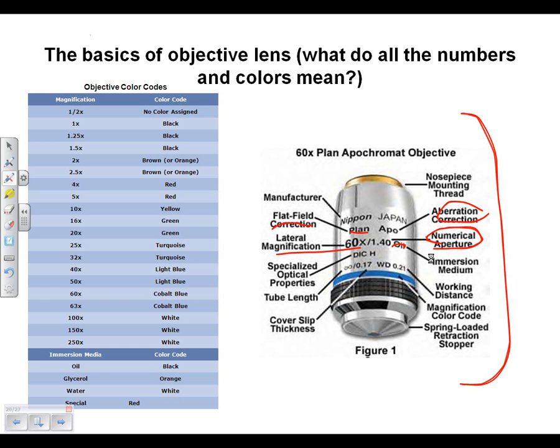And that's because to get really high magnification, if you think about it, there's a lot of refraction that goes on. The light gets bent as it goes out of the slide, through those surfaces and back into the lens. So to prevent that, what you do is essentially have a direct oil bridge so the light gets a lot better path into the lens.